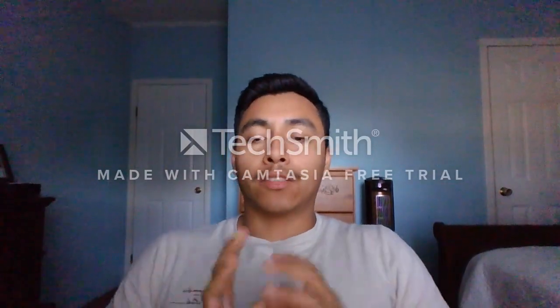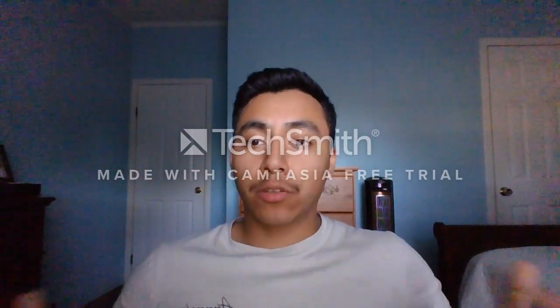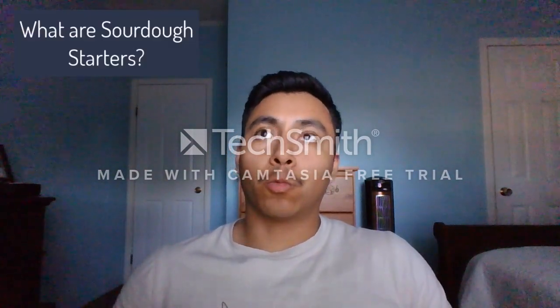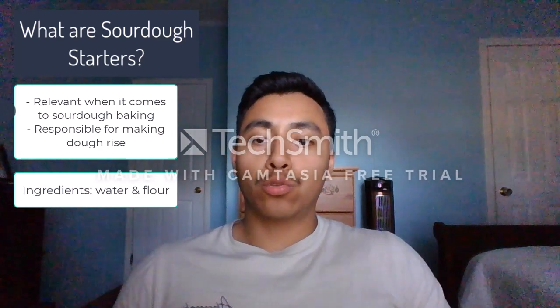During this Genetics 112 lab, we mainly focused our experiments and results on sourdough starters. Before getting to the exact details of how we participated in this experiment, I want to shine light on a brief question: what are sourdough starters? They are essentially relevant when it comes to sourdough bread, are responsible for dough rise, and consist of two simple ingredients, which are water and flour.